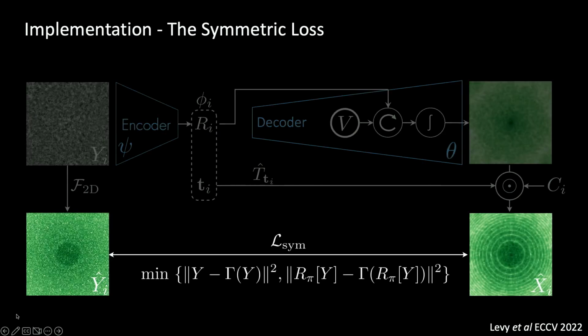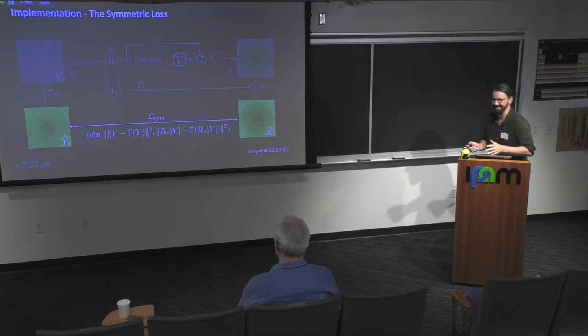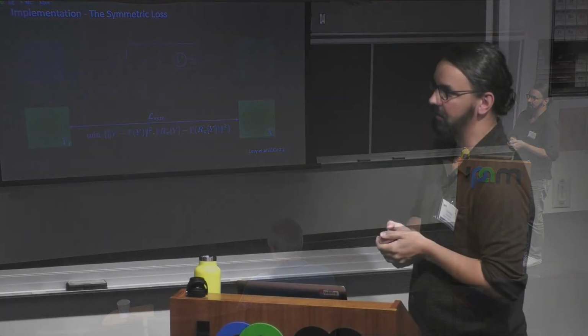So the transformation we made to this autoencoder architecture is to replace the L2 loss with this symmetric loss, right? I hope that was a little bit clear, because I hope it's more clear for you than it is for me. Okay, so that was one development.